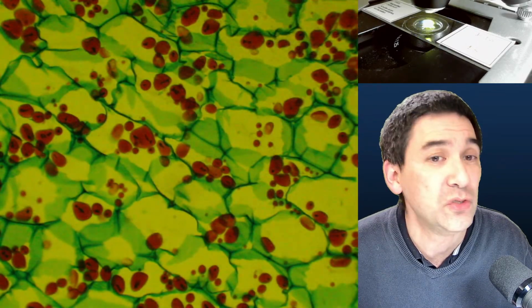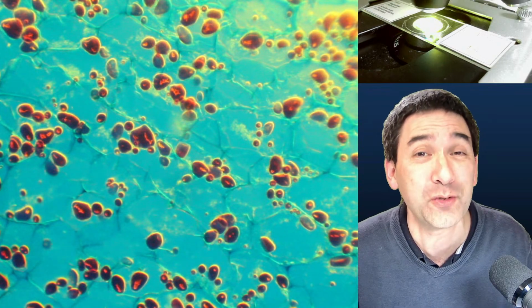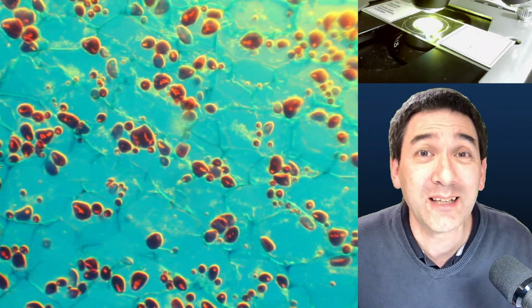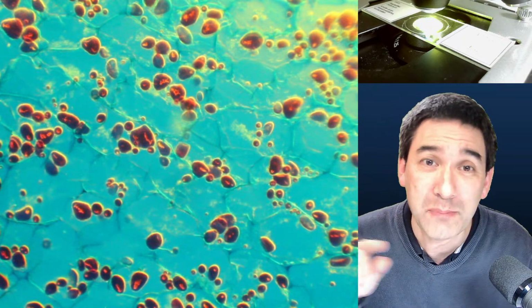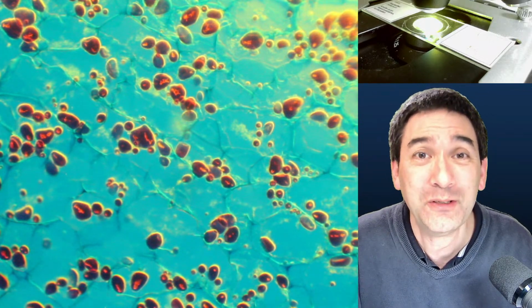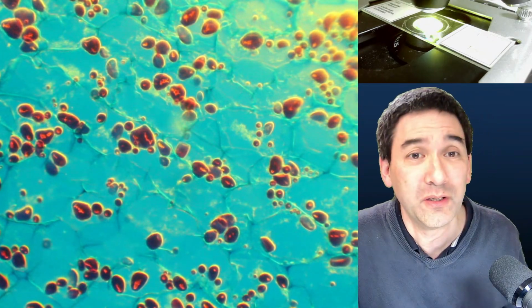Now, I do also have to tell you that the image quality when looking through the eyepieces of the microscope is actually much better than what you're able to see here. The reason is that even though I do have a DSLR camera connected, it's a slightly older model, and I basically put the signal over USB into the computer, and unfortunately the older camera does not support full HD resolution. So the image quality is a little bit worse than if you were to look at it directly. I just wanted to clarify that.